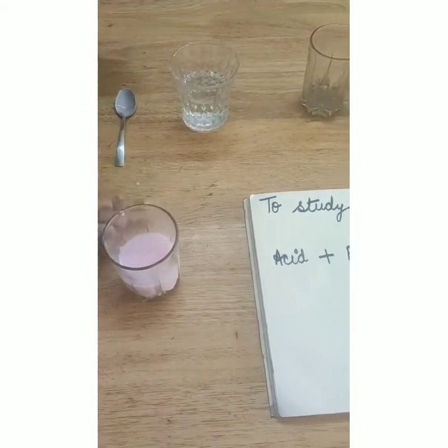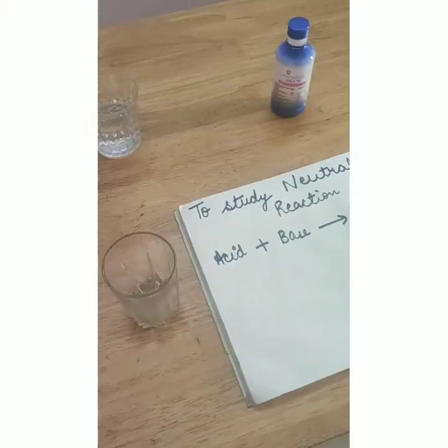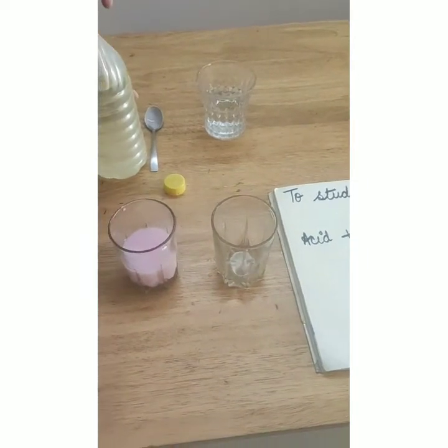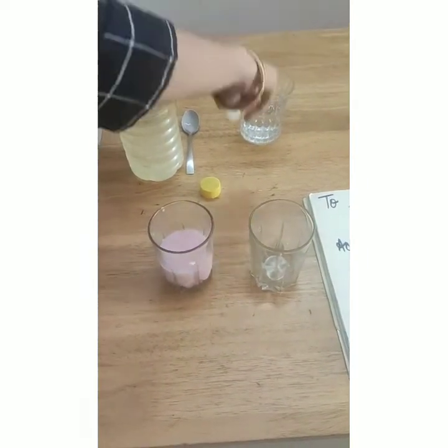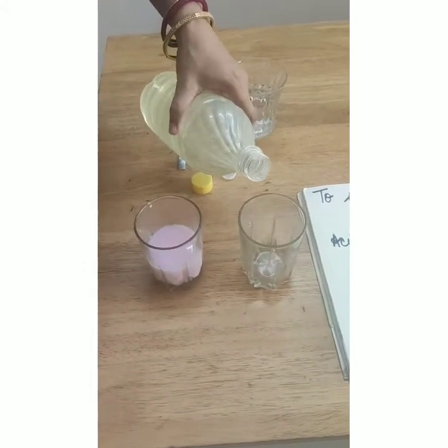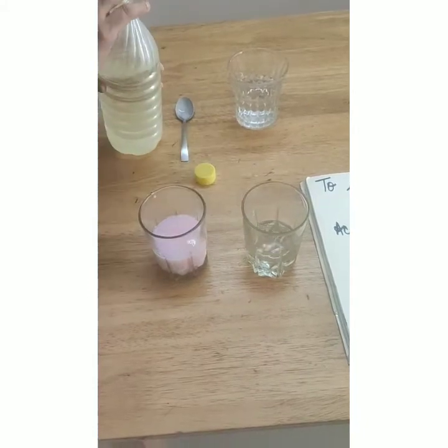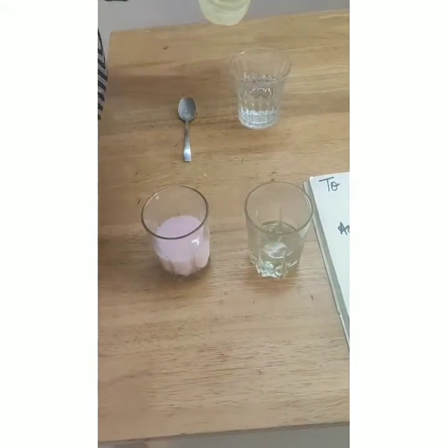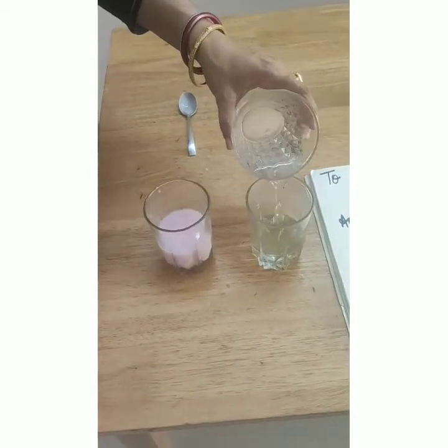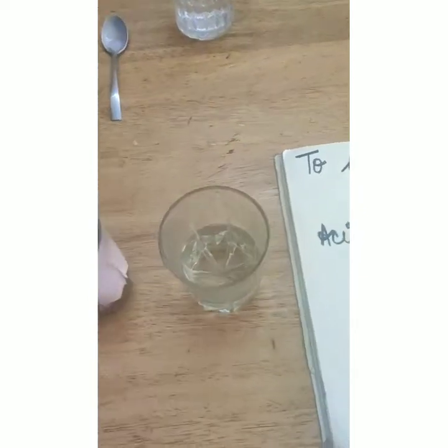Okay. Now, in our next glass, I'm going to pour this HCl. Be very careful when you're dealing with this acid. It's highly, highly dangerous. So what we do is we will put acid in this. And again, like I diluted the base, I am also going to dilute this acid a bit. Can you see the fumes coming? So see, it's so dangerous.